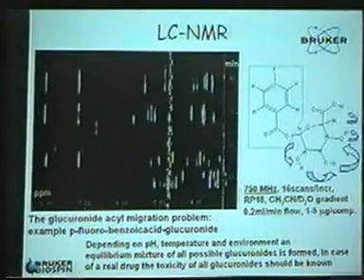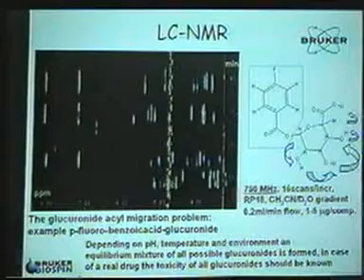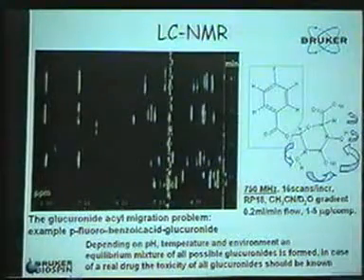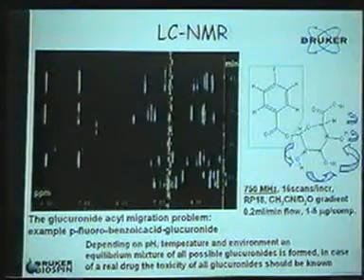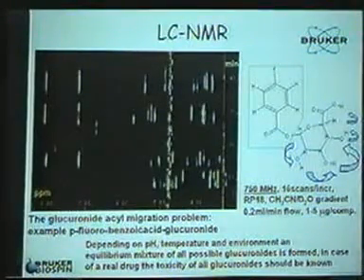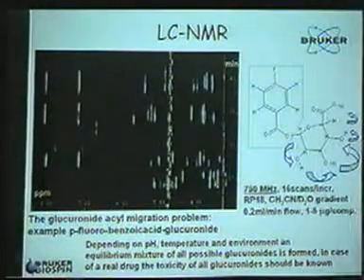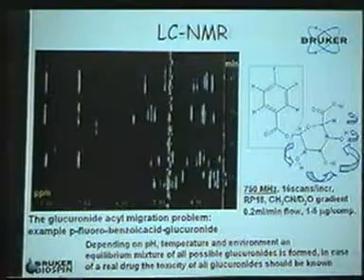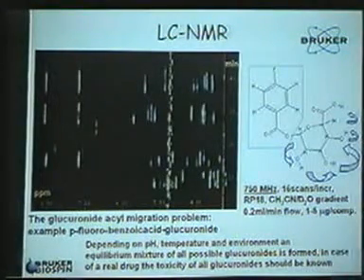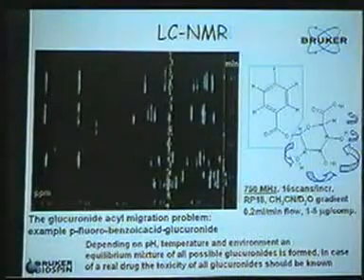Okay? Here is my mixture. I want to see an LC-NMR spectrum. And they had a UV trace of their mixture, and they thought this is the main product, this is the secondary product. And it turned out by NMR that, first of all, the main product was not the main product because it had just a benzene group or something like that. And actually there were many impurities that could not be seen with UV and could be seen with the NMR. Next slide.